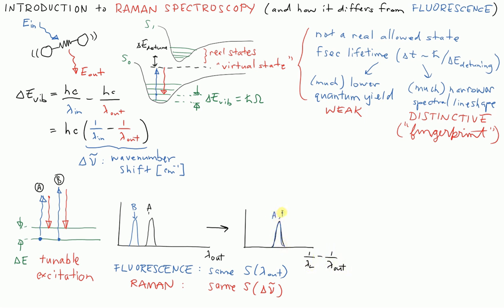You'd have A and B there. So you can, as I said, choose whichever wavelength you want to excite your spectrum at, and if you calculate this quantity here, you will get the same spectrum. And that's convenient. It allows you to use data that was acquired with excitation wavelengths other than the one that your laser happens to have.